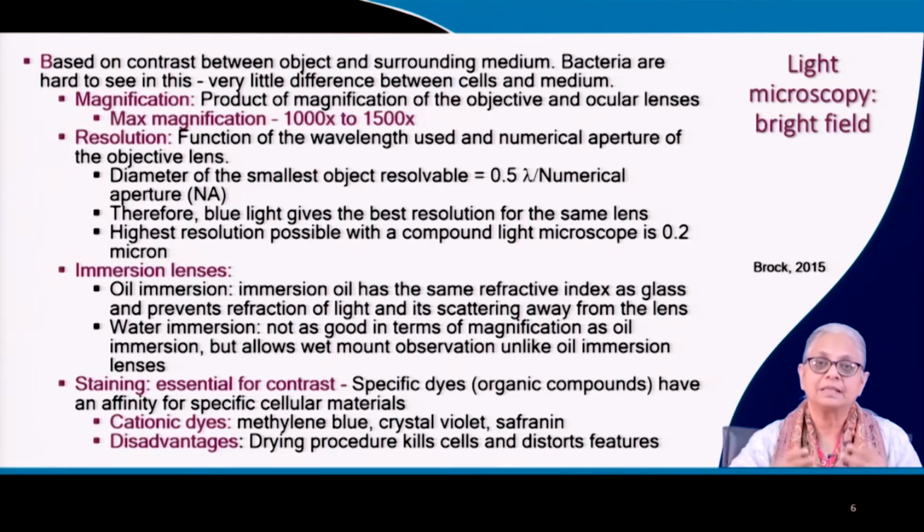You can literally see it teeming with living organisms at the microbial level. So it's a very easy way to look at life without killing it. Water immersion is a very good way to be introduced to wet microscopy, if you want to call it that.